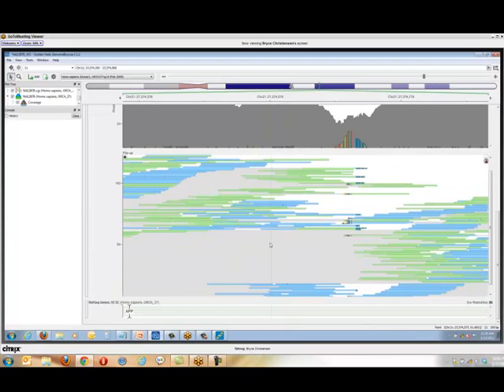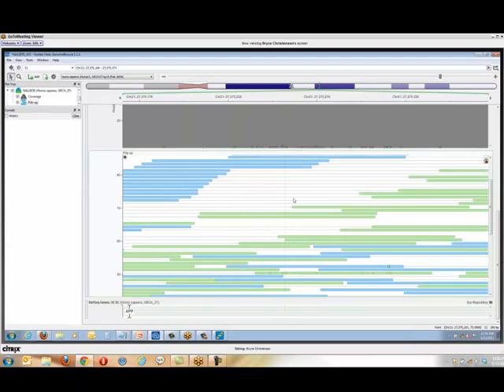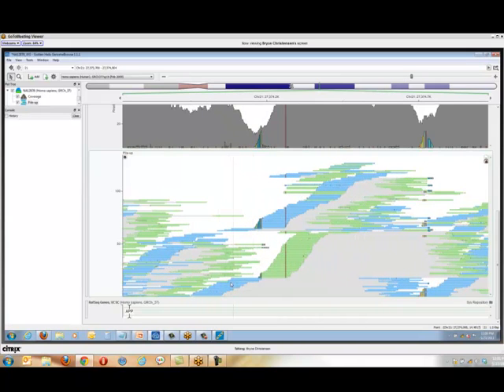If we zoom out and look at the paired end reads here, through most of the genome, we have blue, which is forward strand, which will then be connected by this gray bar representing the paired end insert, to green, which is the reverse read. But over here around this inversion, if you look at it, on the left, where we have reads spanning this one breakpoint, we have forward strand connecting through to a forward strand, while if it's spanning the right-hand breakpoint, we see reverse connecting through to reverse.